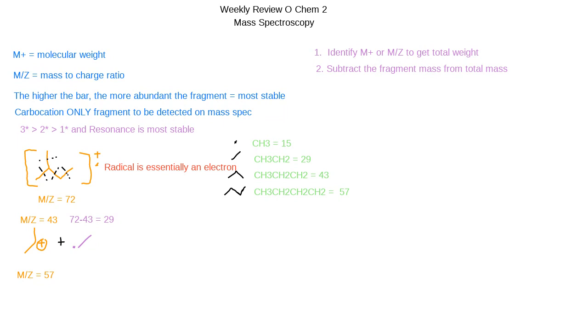Okay. So next up we have 57, and luckily because we already did all the work here, we just have to use this key, and because we already know it in our heads, we can just apply that. Now 72 minus 57 gives us 15. Okay. And let me write that down. 72 minus 57 equals 15. Okay, now 15 means we have to cut exactly one methyl.